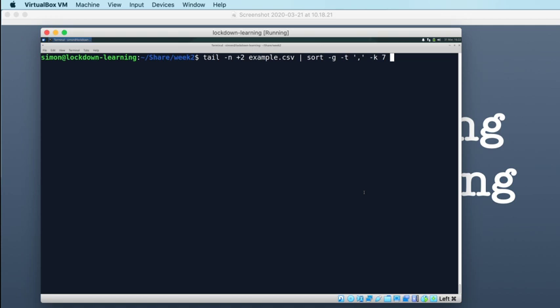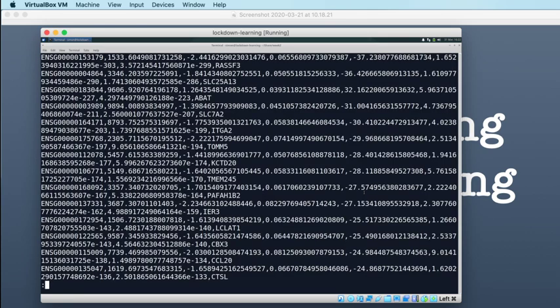It sorts as if the E minus X would not be there. So where do the E minus X numbers end up? Do they end up at the top or the bottom? If we pipe this into less, this works for me, because this number, which is 3 times E to the minus 299, is smaller than this number, which is E to the minus 286, which is smaller than this. So is this sorting by 3.5 rather than 3.5 times 10 to the minus 299?